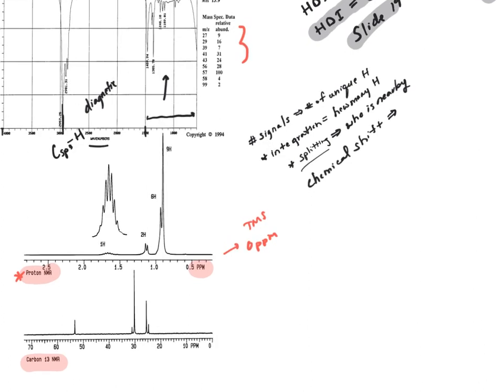So for chemical shift, especially in these early ones, just as a reminder, methyl protons, we can expect them at about 0.9 parts per million. And again, you're saying, well, where are you getting this data? Watch the lecture videos. Methylene protons, so those CH2s, we can expect those at about 1.2 parts per million. And then methine protons, which are just the carbon bound to something else, so CH, these protons, we can expect these guys at about 1.7 parts per million. Okay, so now what are we going to do with that?